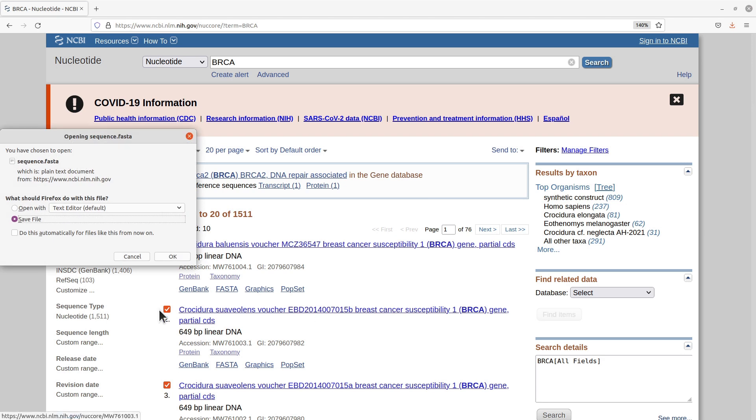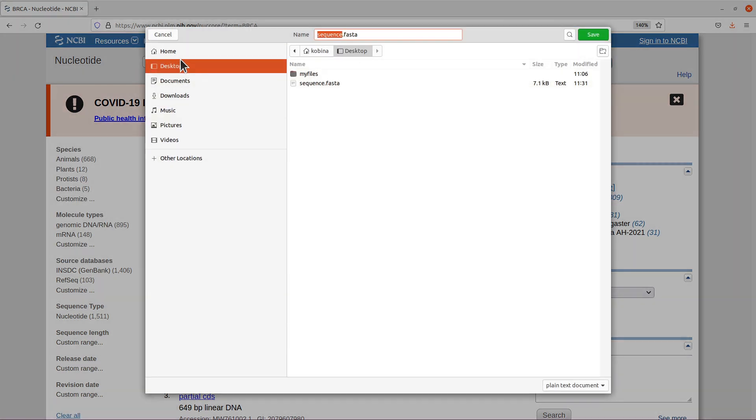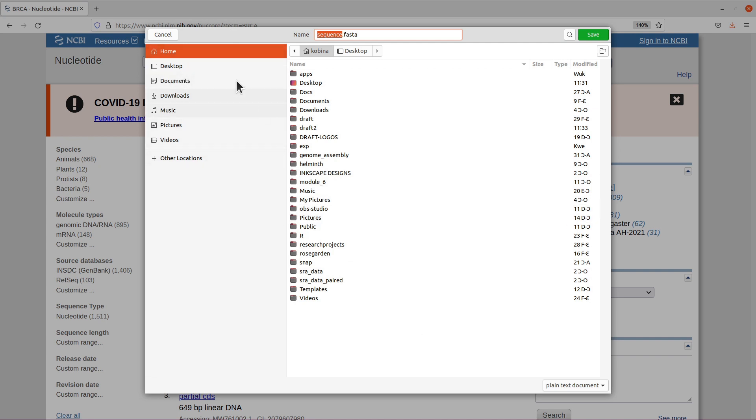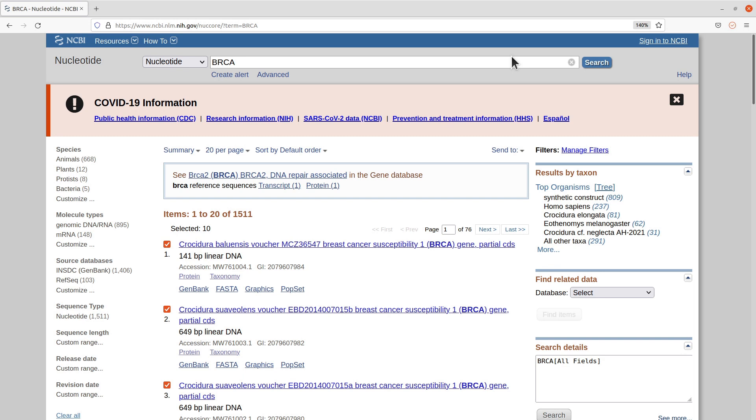I'll save it in my home directory here. I'll leave the default name here. It's called sequence.fasta. That is what I have there. So it's saved.